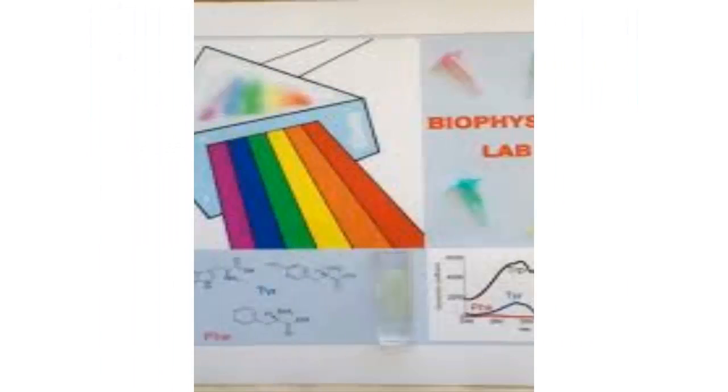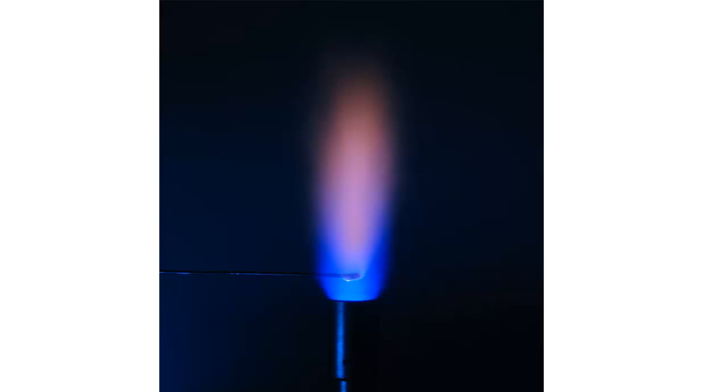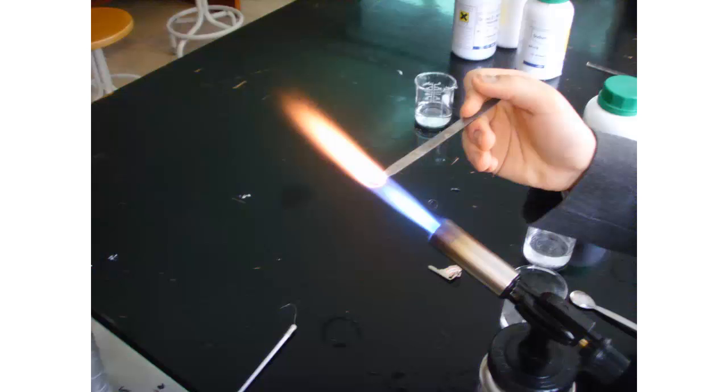The principle of this device is based on optical spectroscopy. As we studied in school chemistry laboratories, we know that every element burns in a flame with a particular color, and the intensity of the light emitted by the flame is proportional to the amount of the element. The elements in groups 1 and 2 of Mendeleev's table are the elements this device is focused on.